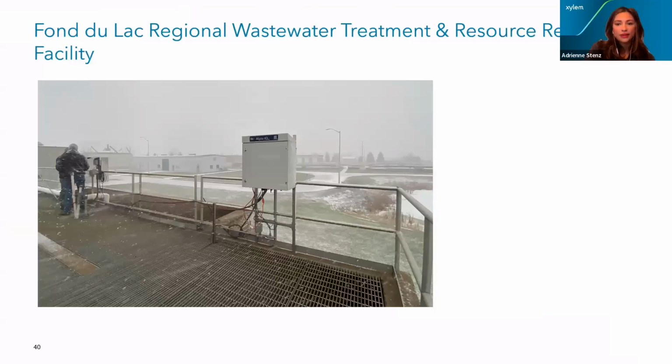This is where the Alyza PO4 analyzer is located. This concrete channel is the aeration outfall channel following pass through. The Alyza unit was installed last year, just as their EBPR system was going online. In this location, the Alyza serves a dual purpose.